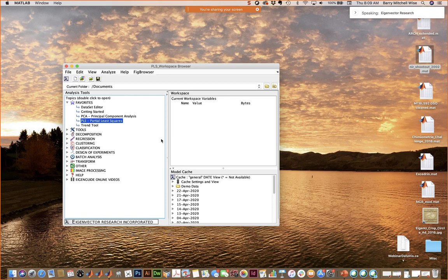As far as color by goes, that's always going to be monotonically increasing or decreasing, because color by is used on real values, whereas classes are essentially integers and you can rearrange them. So I don't know if that answers that, but if you choose classes instead, you can change that.